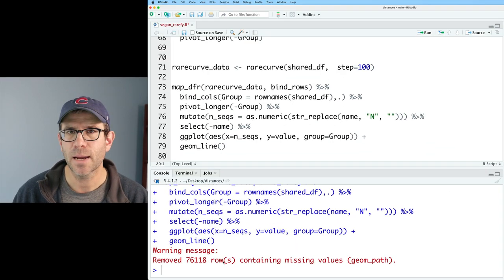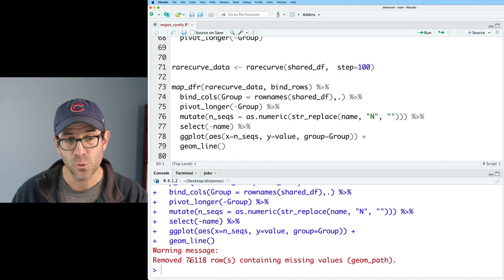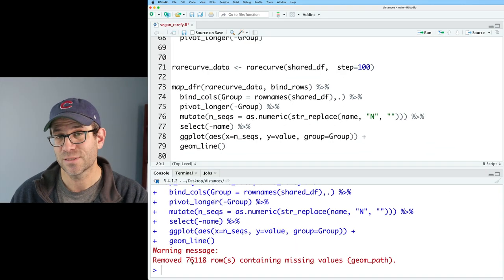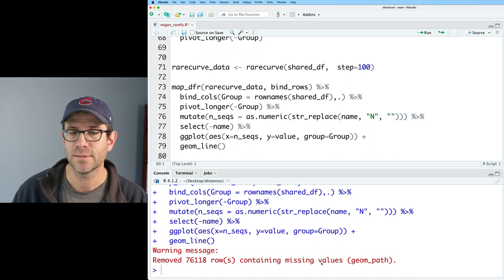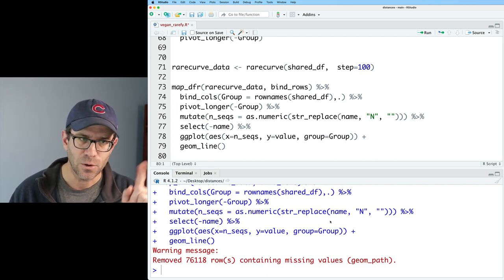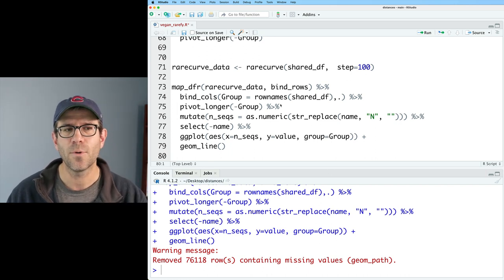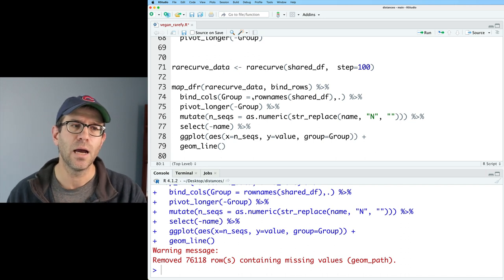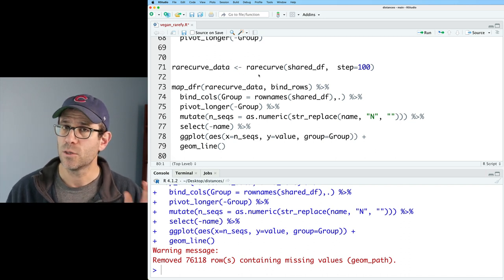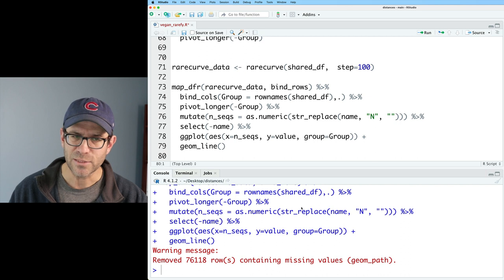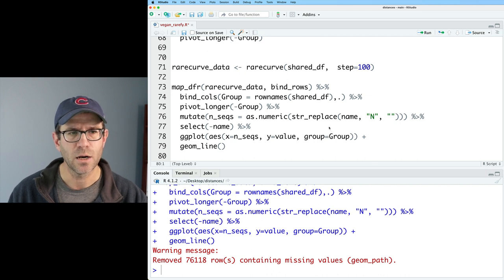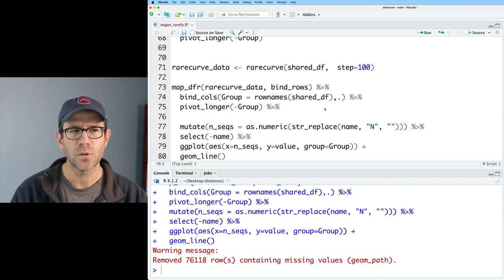And when I come back to my console, I see it removed 76,118 rows because they contained missing values. So if you remember, when we looked at the right side of the output of our map_dfr, there are a bunch of NA values. Well, that's what's going on here. So we need to go ahead and get rid of those NA values.